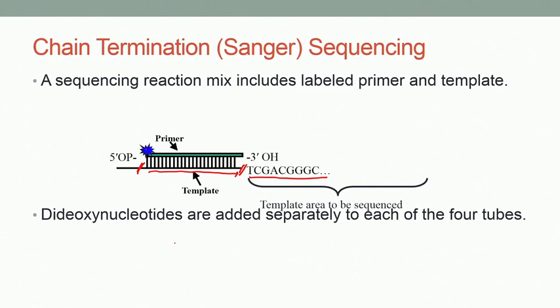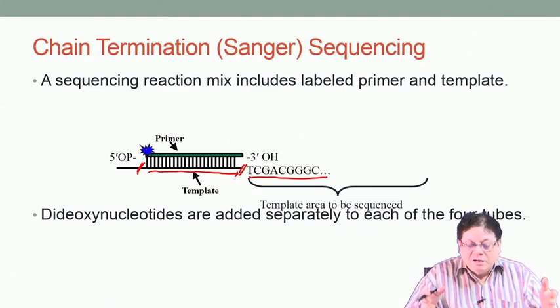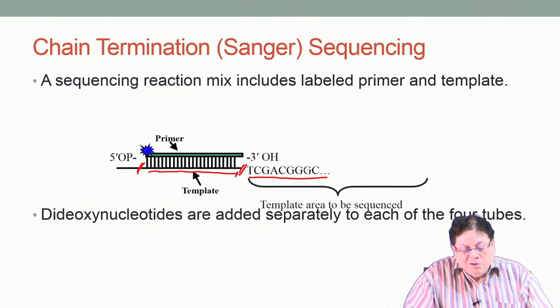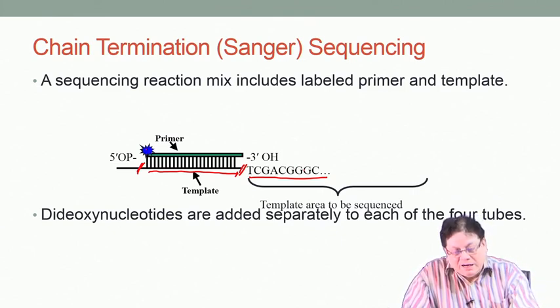That is needed because ultimately you have to find pieces where that label has to be there, otherwise it will be all mixed up with the other nucleotides present there. So, you need a tag which will ultimately act to determine basically the nucleotides that are truncated.